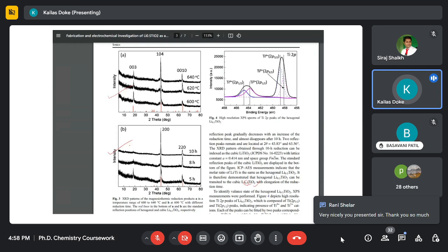This phenomenon in chemistry we call polymorphism. When one crystal gives two or more crystalline forms, it is called polymorphism. That is the purpose of explaining only this particular slide. Okay, exactly, it is 5 o'clock. I will stop over here.